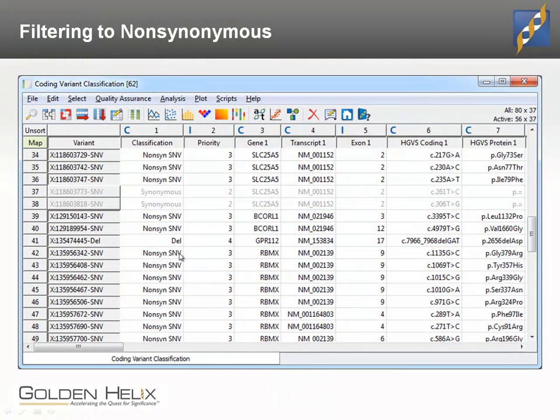I explained this a little bit, but to go into more detail, this is what a coding variant classification report looks like, where for every variant that falls within the gene annotated regions that code for amino acids that are part of the total protein sequence, a variant inside of that region will come up here, and it could be deletions, insertions, or single nucleotide variants, and they could potentially change the protein sequence or not.